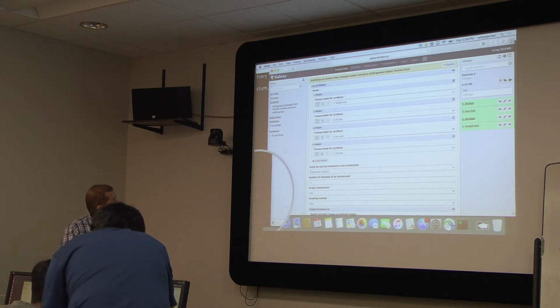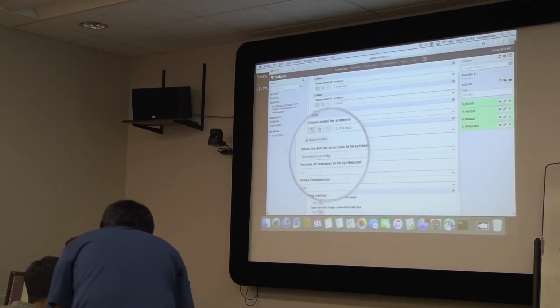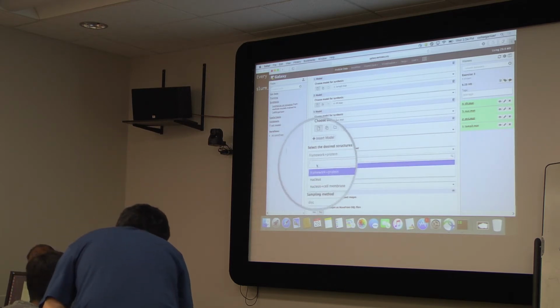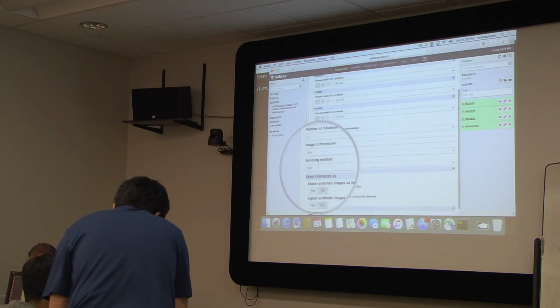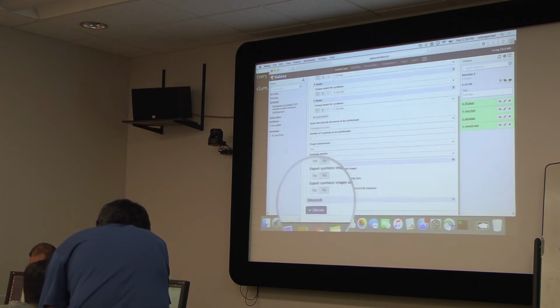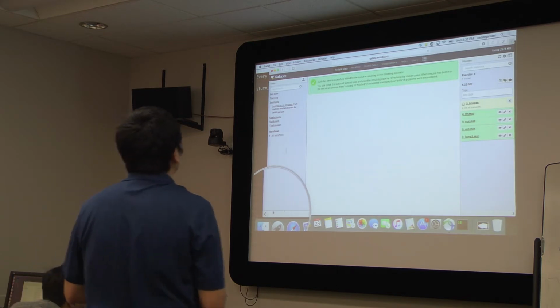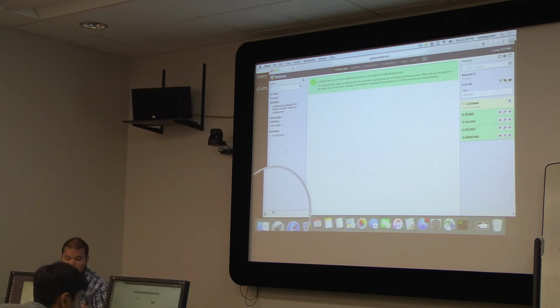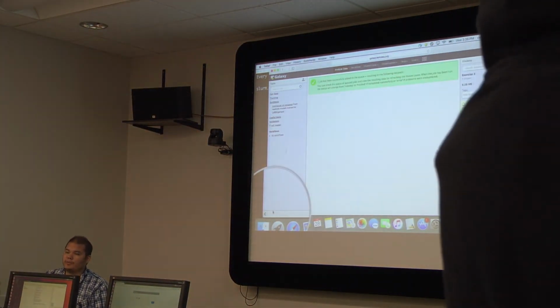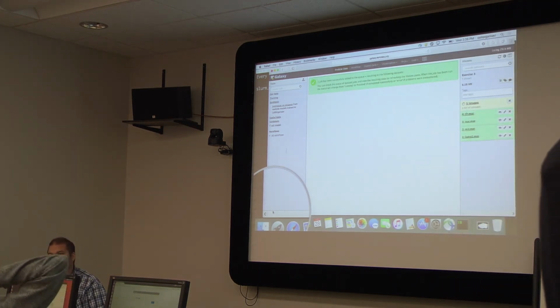Synthesizing them all with so many objects like this will take a little bit of time. So it's basically the same thing we did before. We're just going to generate an instance with more objects. We're going to synthesize one image from disk like this. And this should start a process of creating a much larger image. Now what happens when you submit images at different resolutions is that it's going to select the pattern with the largest resolution, and it's going to upsample the lower ones to reach the higher. Okay?